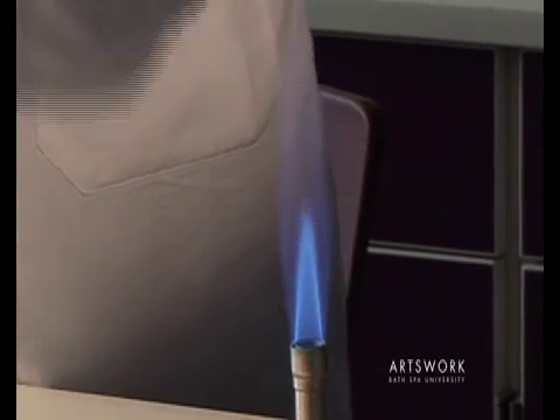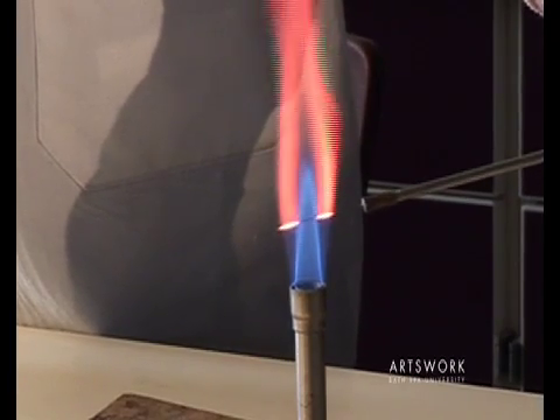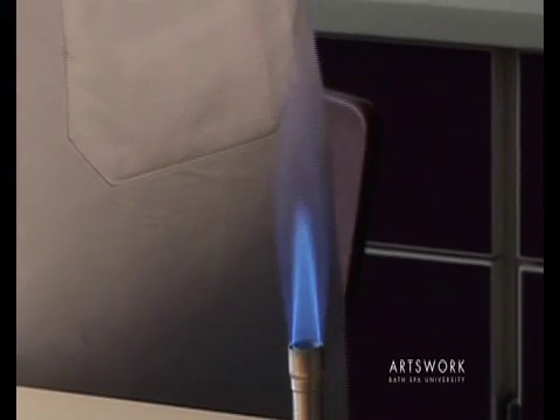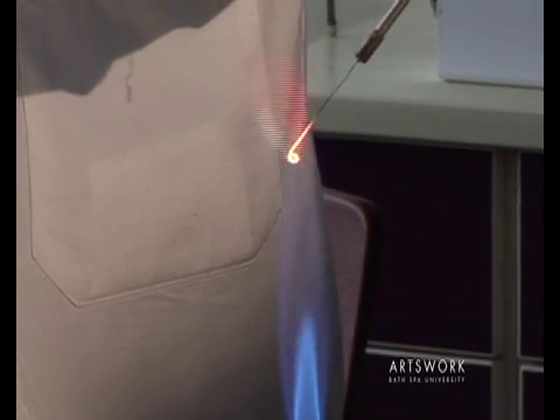If you put the loop too low in the flame, you're only sterilising parts of the loop at any one time. Alternatively, if you have it too high, the flame is cooler, so it's not as effective at sterilising that loop.